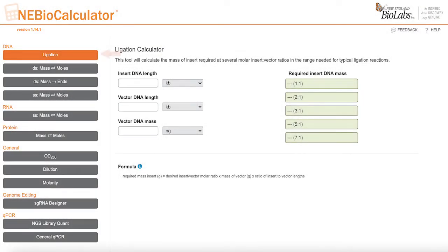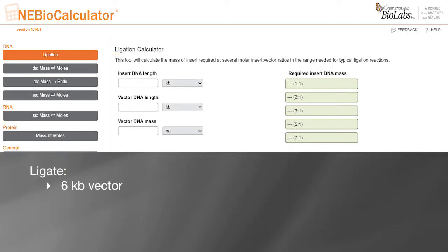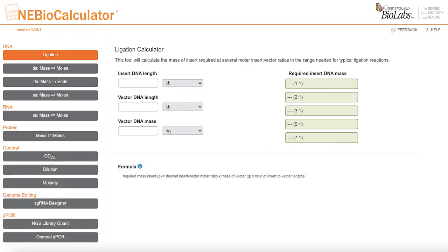In this tutorial, we will plan a ligation reaction where we ligate a 6 kilobase vector fragment and a 2 kilobase insert fragment. First, click on the ligation calculator module.